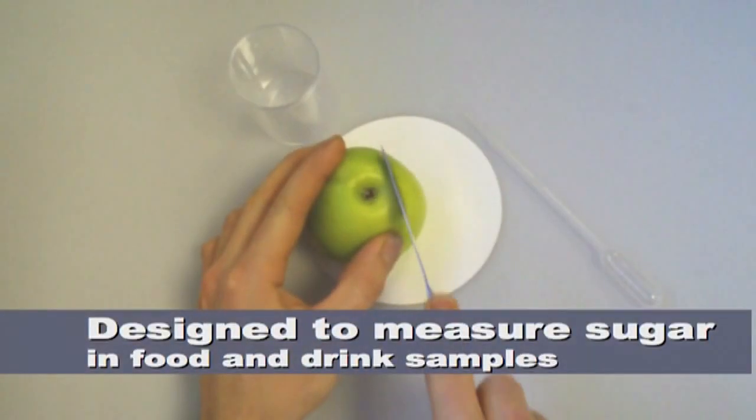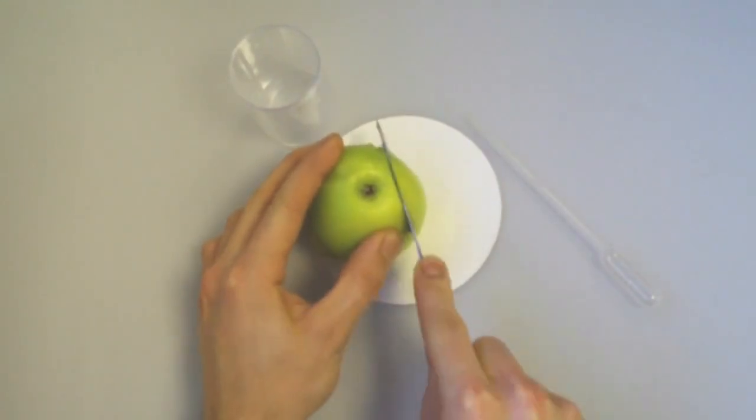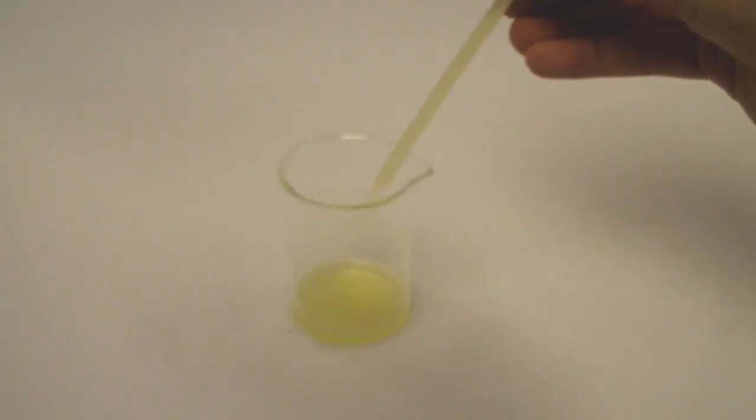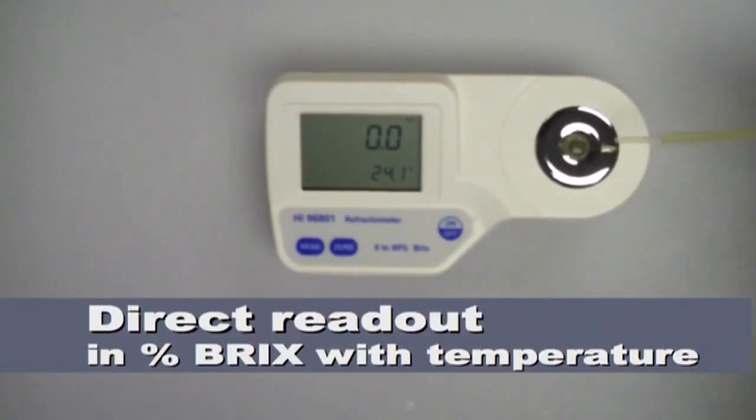Whether you're extracting juice from fruit or testing jams, sauces, or cordials, it's a simple process. Place your solution in the sample well and press the read button for direct readout in percent Brix, complete with temperature.